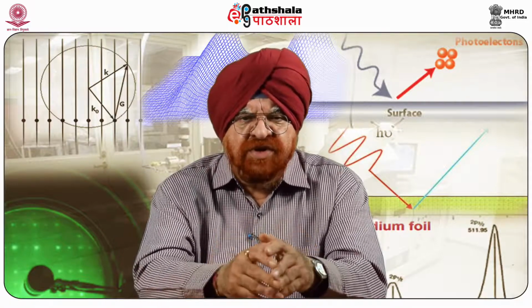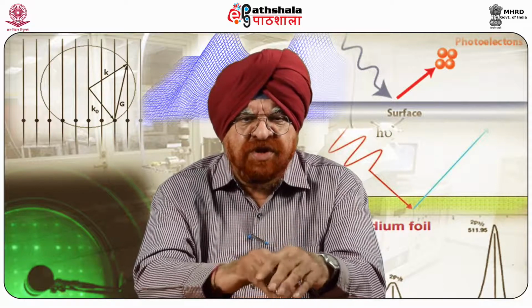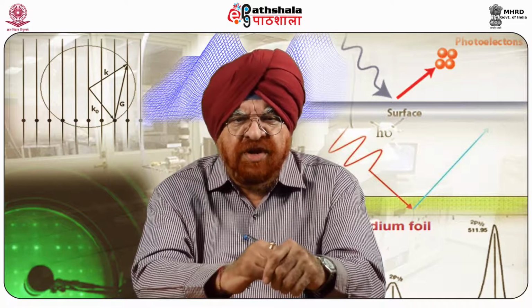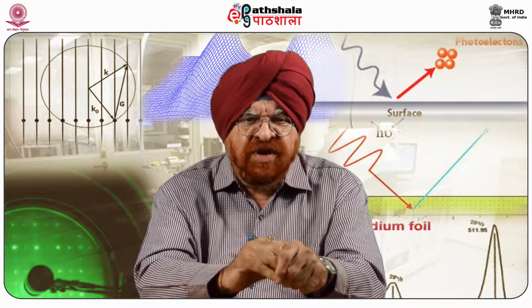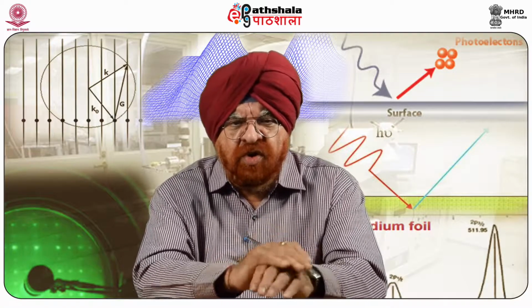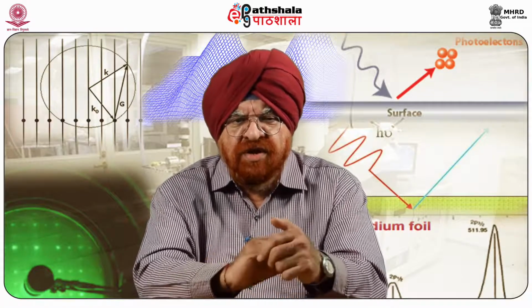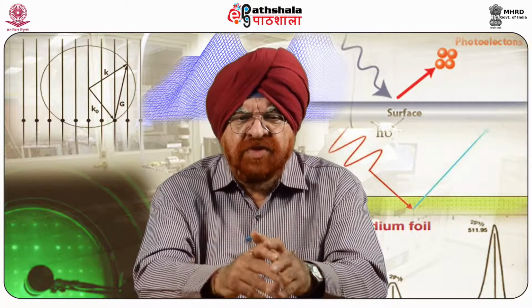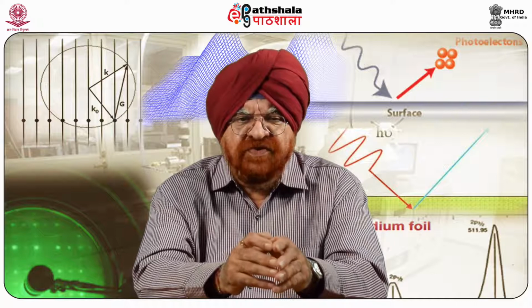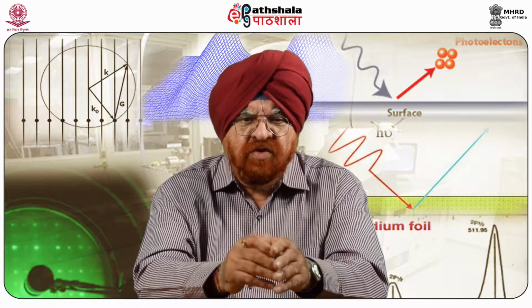AFM and MFM images of the sputter deposited SiMn 20% film after thermal annealing at 600 degrees centigrade. The AFM scanning was performed in the tapping mode, whereas MFM in the lift mode by means of a cobalt chromium coated tip magnetized just before scanning.